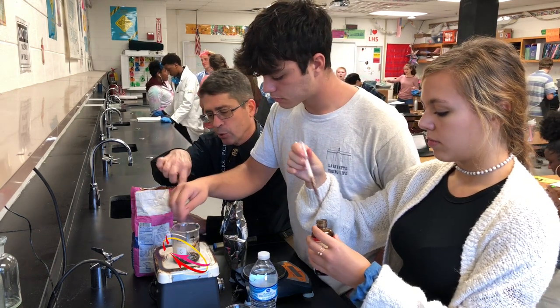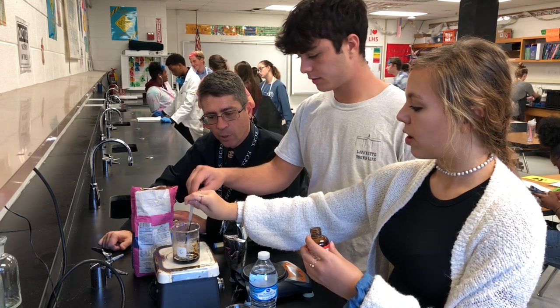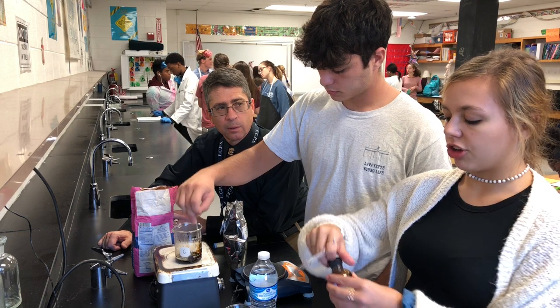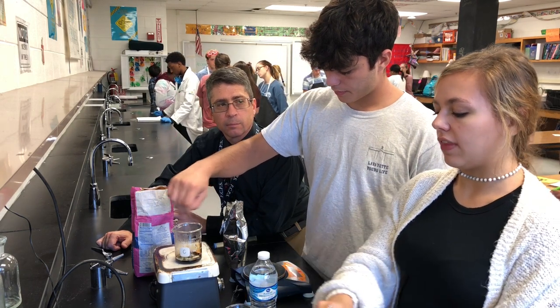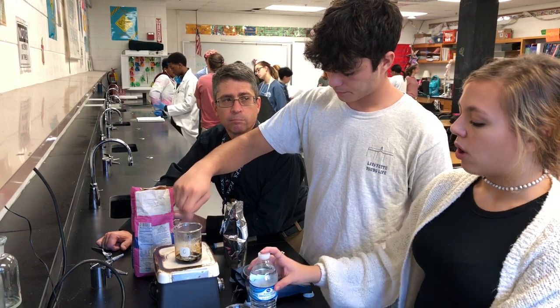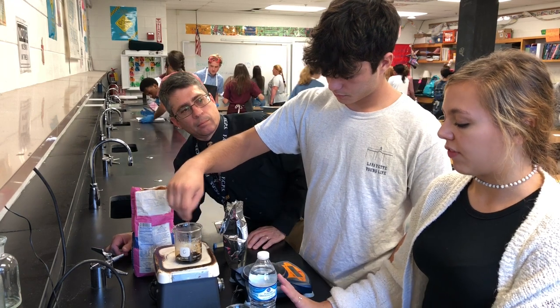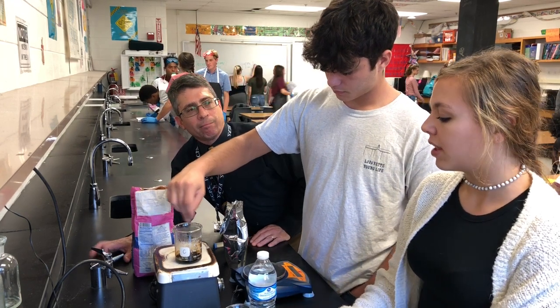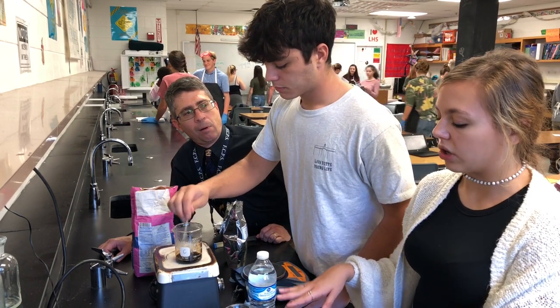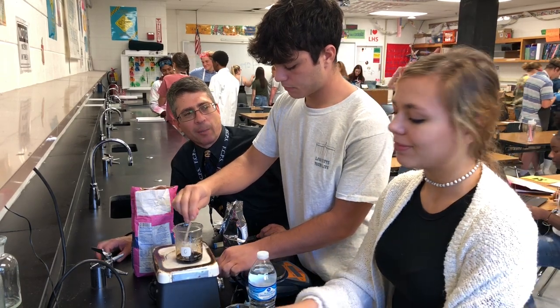So after we mix it up and add the sugar, what's going to happen to it later? We're going to mix it with a sugar and water solution, and then after we heat both of those to 37 degrees Celsius again, we'll place it in a drinking bottle. And we'll let it sit while the fermentation takes place. How long does that take? It takes about a day. You could let it sit longer to have it be more carbonated, but it would actually explode the water bottle. Well, we don't want to do that. That'll make a mess.